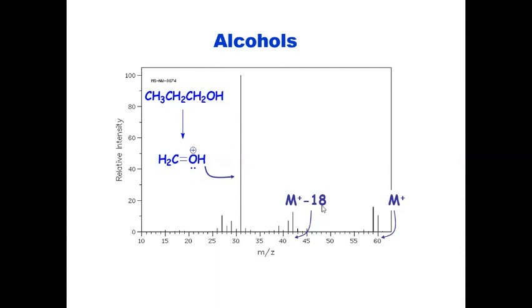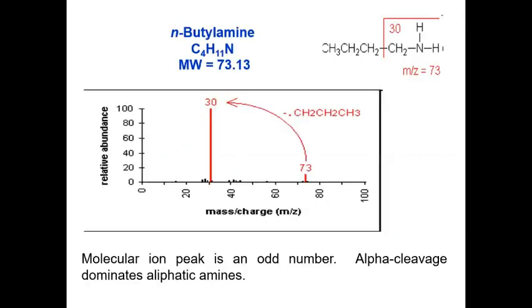So if there is a removal of water molecules from a sample, based on that we can tell the molecule is an alcohol. If we know the molecular mass of this compound, and M minus 18, a loss of molecular mass of 18, it shows the presence of an alcohol in the given sample.